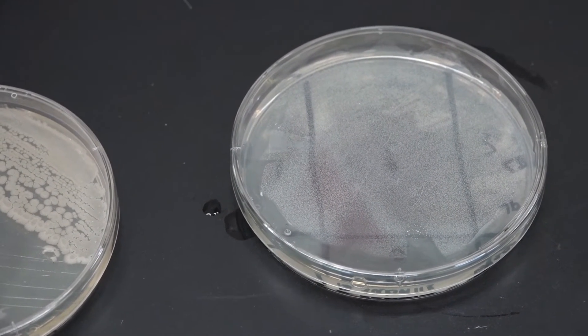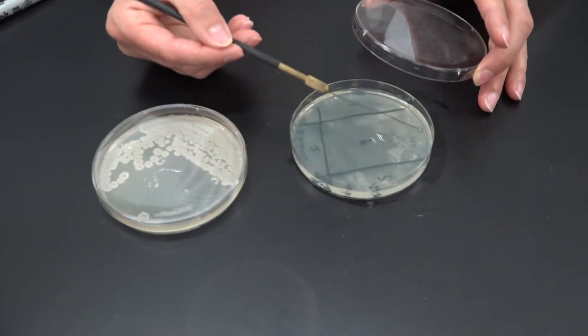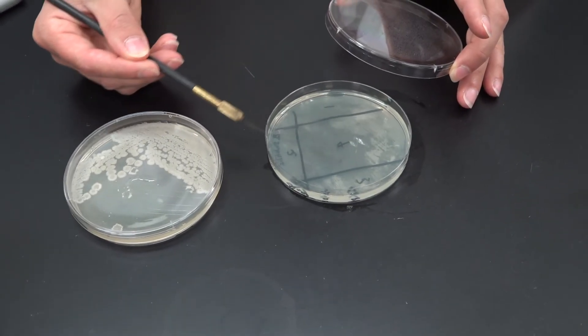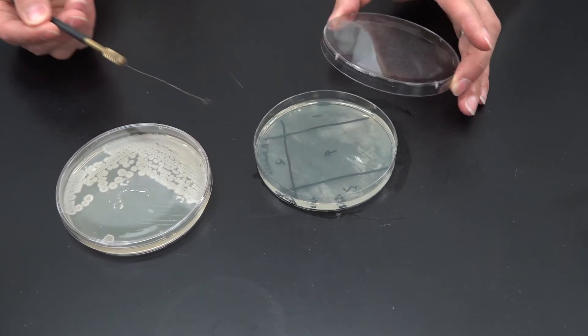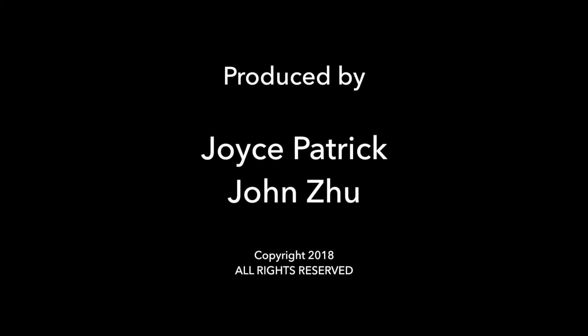Sterilize your loop one final time. Then you're going to streak from three and spread throughout all of quadrant four. Use up all the plate space you have.